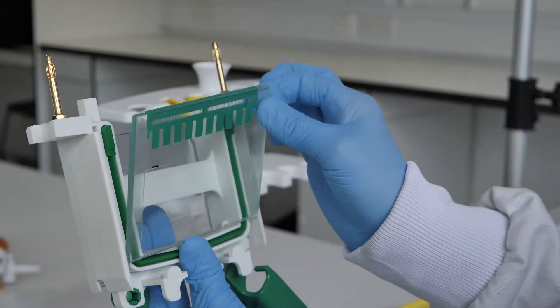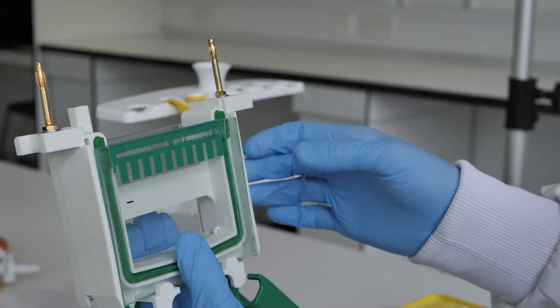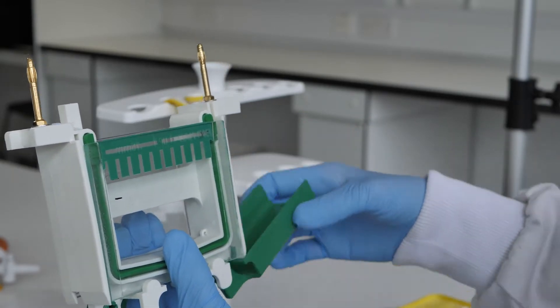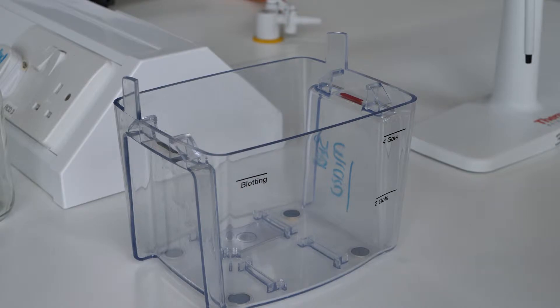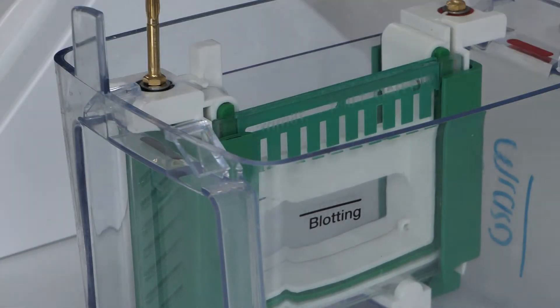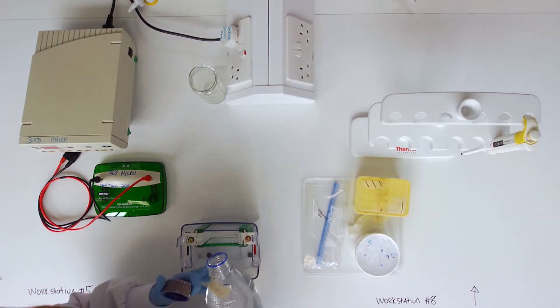Two gels may be run together, or a dummy plate may be used at one side of the gel chamber. Insert the assembled gel chamber into the electrophoresis tank. Fill the chamber between the gel sandwiches with 1X running buffer.